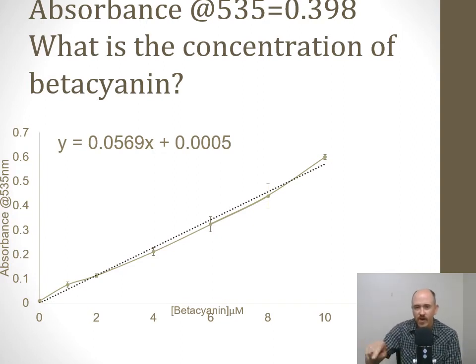Then we would use our standard curves from the previous week to convert that absorbance data into concentration. And the best way to do that is to use the equation of the line, y equals mx plus b. Because you have a standard curve, you know what m is and you know what b is, because you can go to insert best fit line, show equation of the line in Excel, like in the videos I made for you. You can see how that's done.